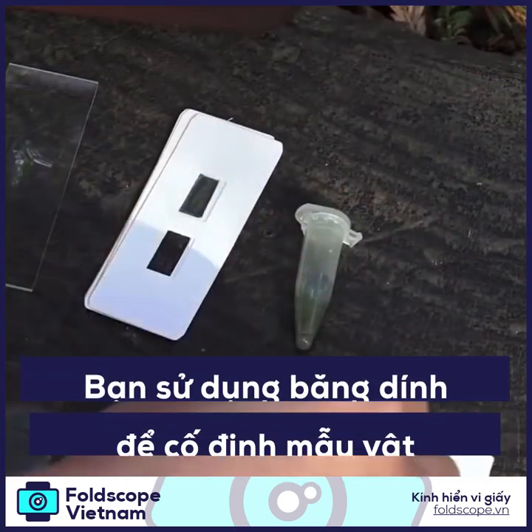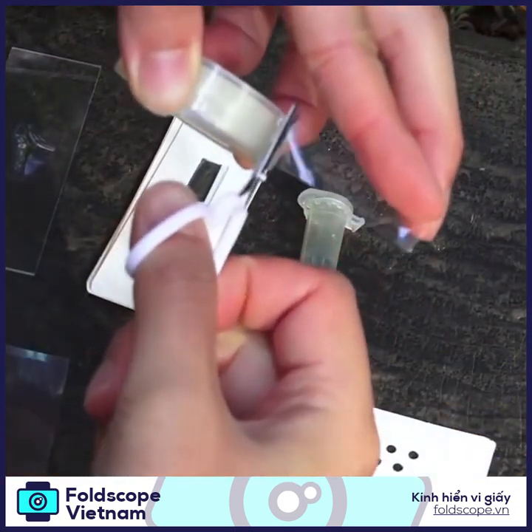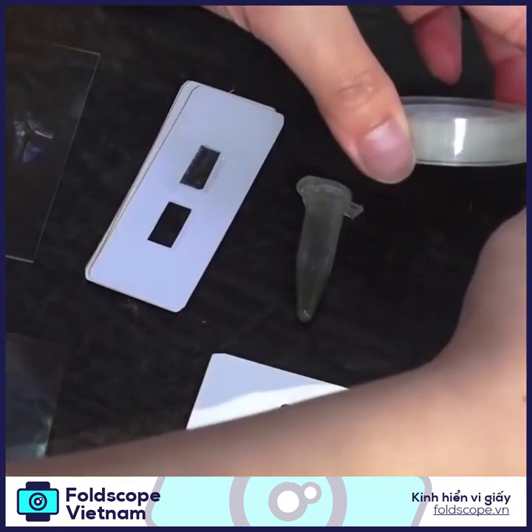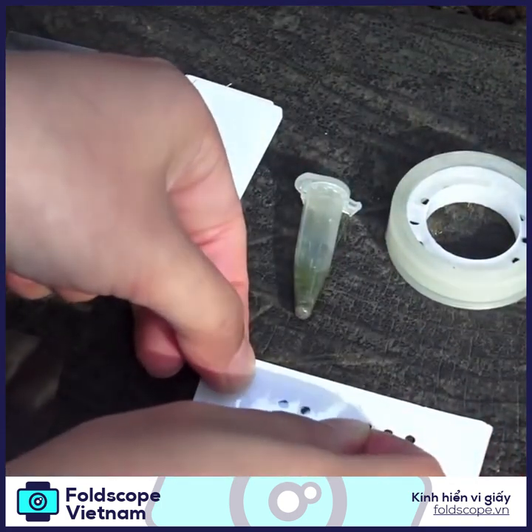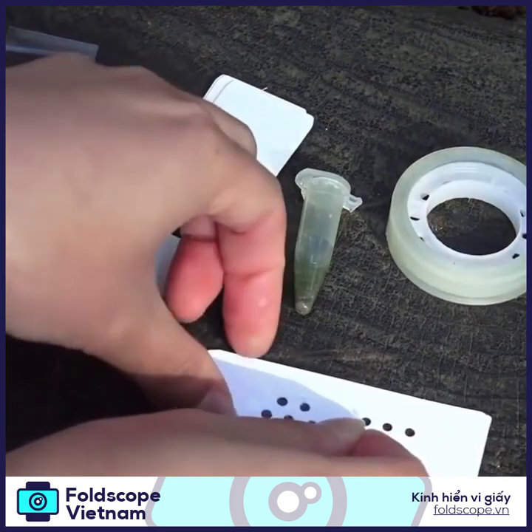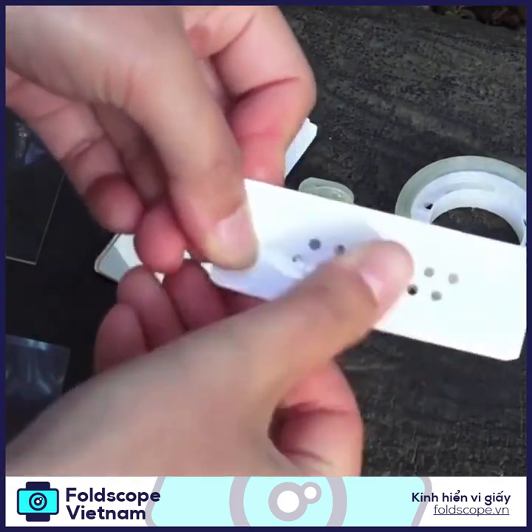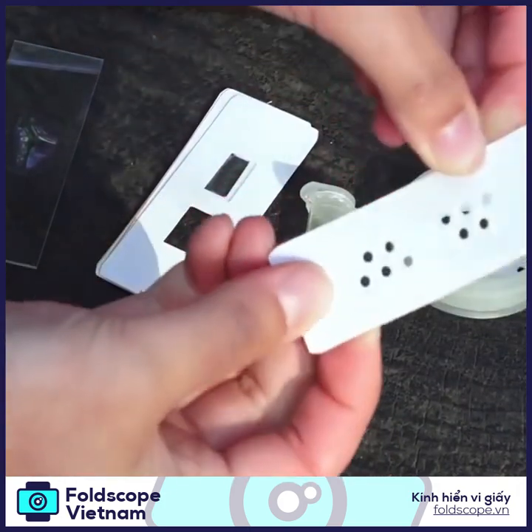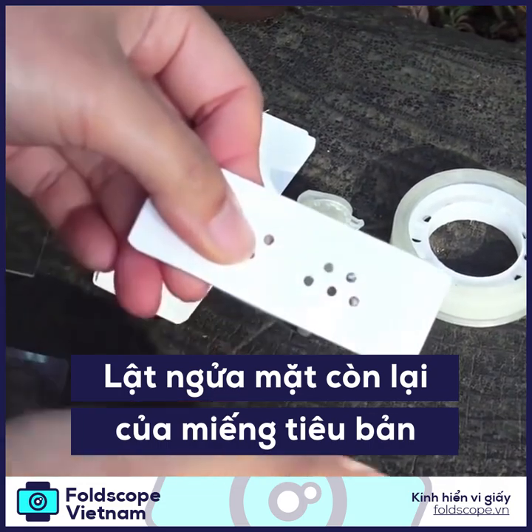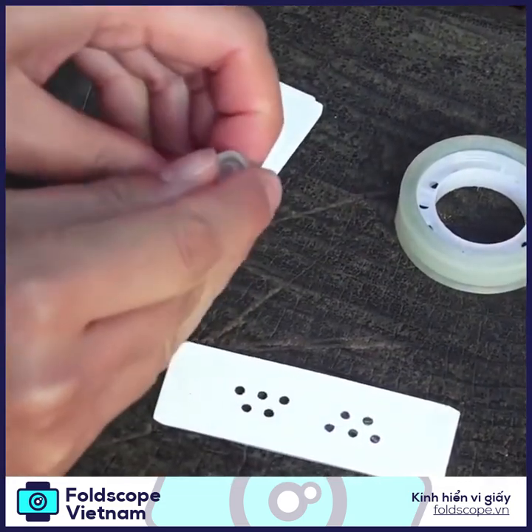The first step is to put a strip of cellophane tape — you can cut it with scissors like that — and put it over the micro wells. Make sure that it's attached to one side, then flip it over so that the sticky side of the tape is facing up.